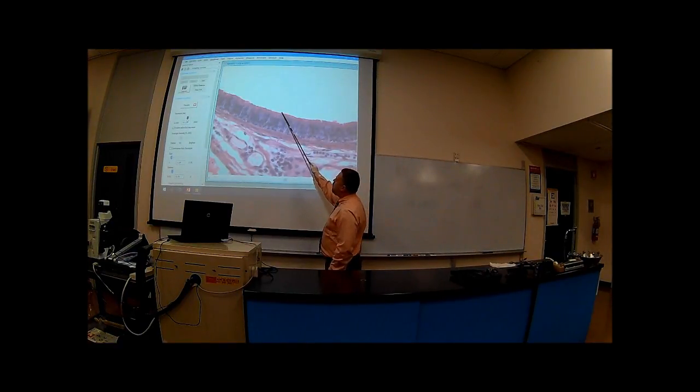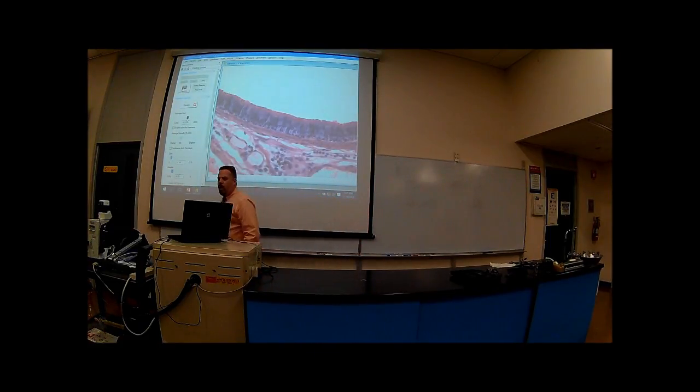And what do we see, these little things over here? If you get up really close, you can see them. These little hairs sticking up closest to the lumen, that's cilia. So this is ciliated pseudo-stratified epithelium. Right? So you have an idea where we are when we're dealing with the respiratory tract. This is going to be more or less the trachea.